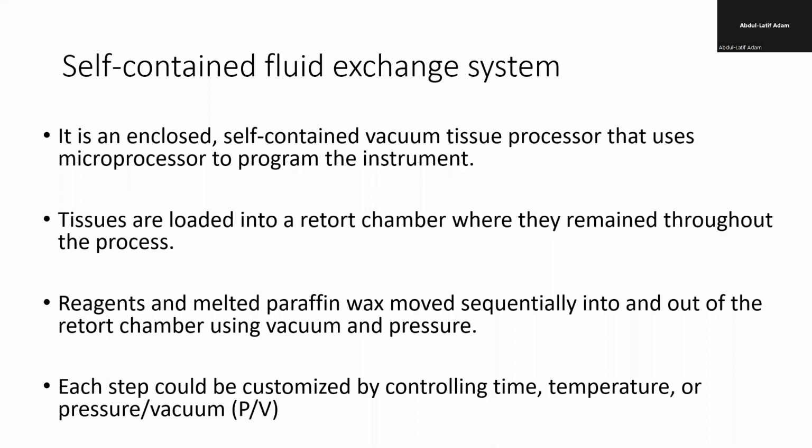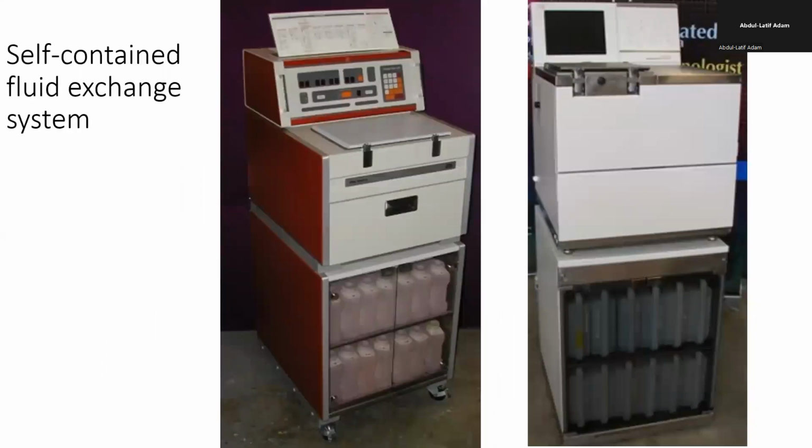Okay, aside from the workload and the turnaround time, it also enhances penetration. So tissue processing is very effective. Okay, so this is the fluid exchange one. This is the one where the tissue stays in one place and the fluid goes to replace. So the containers down here contain the chemicals that are used.